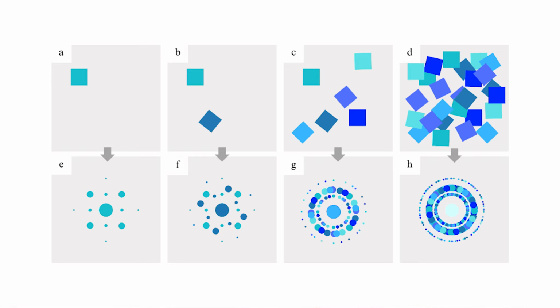And now to your question, what we have developed, the first piece of software, which is called STEMDiff, so scanning transmission electron microscopy converted to diffraction, converts this huge data set to this single powder electron diffraction pattern. So this is the core, and this is the part of the program that Pavlina helped us with very much. The second program is, let's say, quite trivial, and there are other pieces of software.